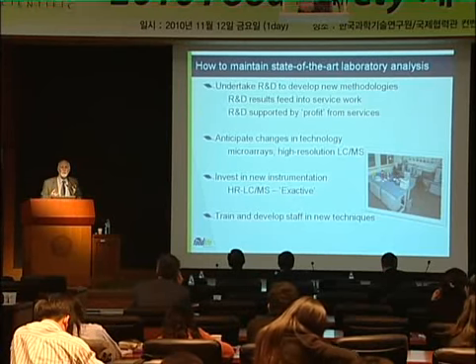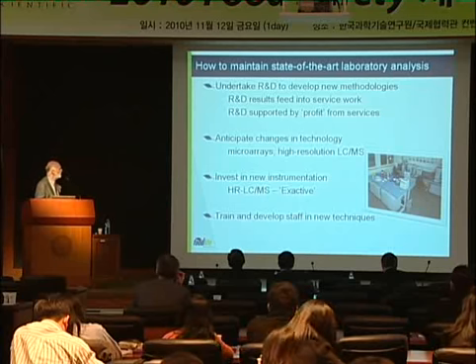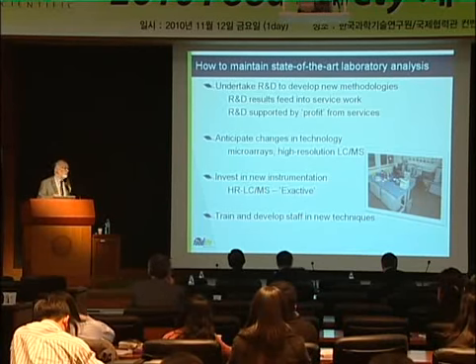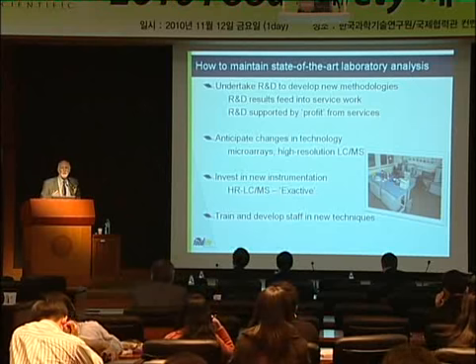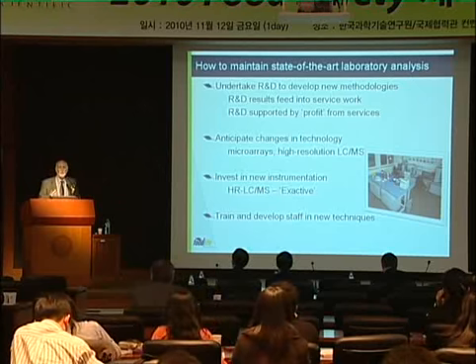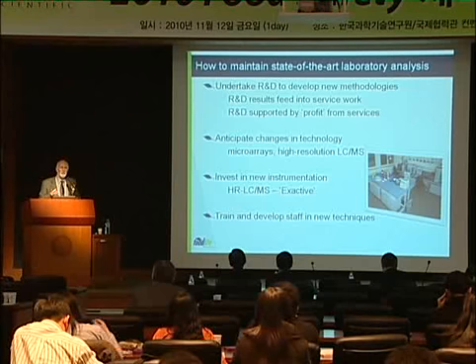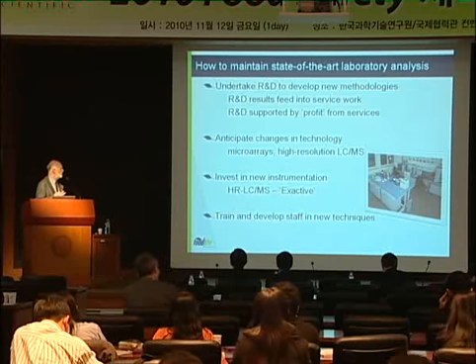Probably 10% R&D or 20% R&D with 80% service delivery. But it's more complicated than that. One of the jobs of the managers of the laboratory is to anticipate how technology is changing. So managers of testing labs come to seminars like this to find out what's going to happen in the future. What are the changes? What are the new technologies? Because if you don't invest at the right time in new technology, you get left behind. So it's absolutely critical to be successful in this field that you maintain your investment in critical technology.